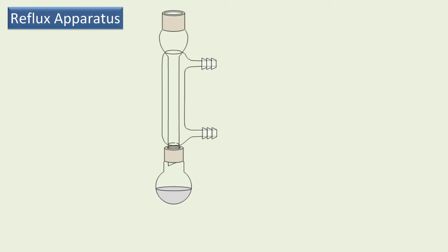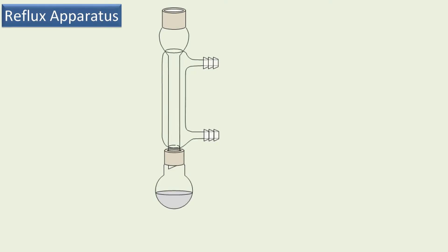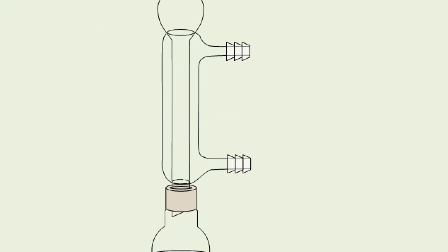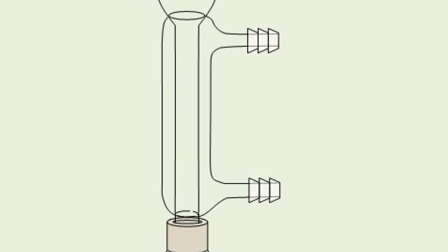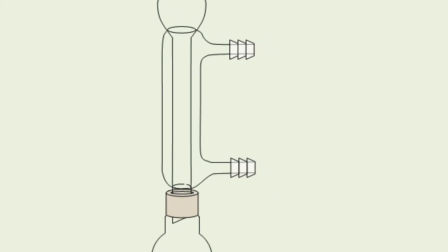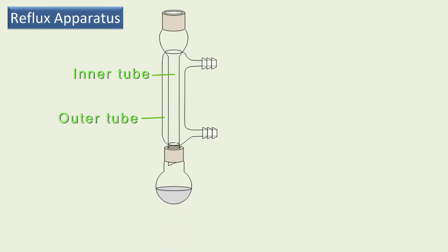A condenser is fitted on top of the RB flask. Looking closely at the condenser we can see that it's a tube within a tube. We have an inner tube surrounded by an outer tube. The outer tube has two openings, one at the top and another at the bottom. We call these ports.